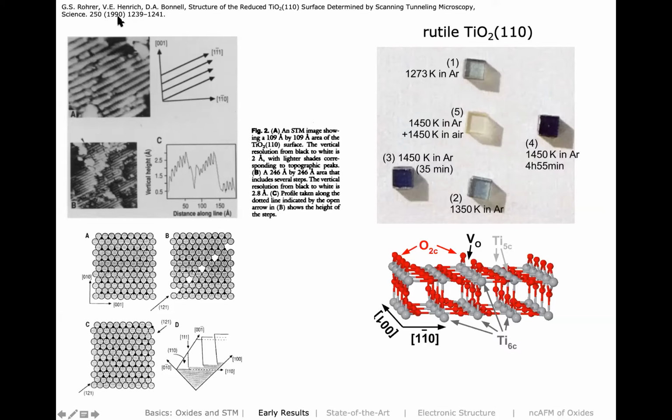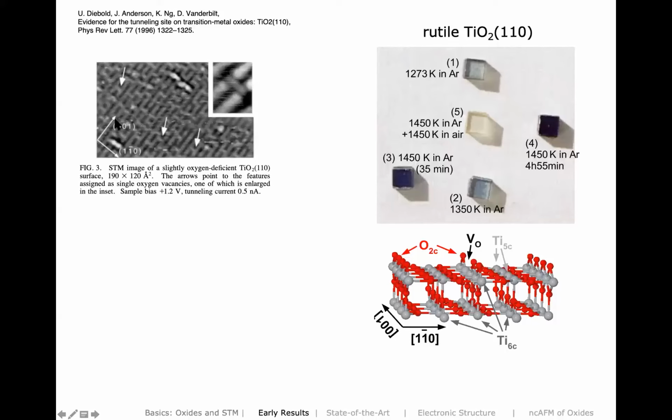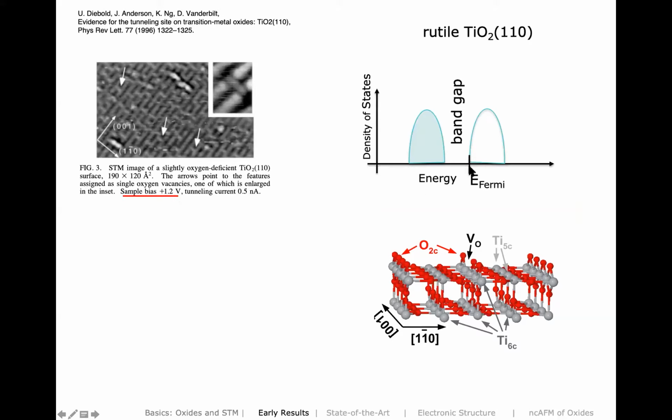So this was 1990. Here comes this young assistant professor from the United States, in 96, and she published her first paper on TiO2, where the directions are right, see 001, and also here these oxygen vacancies. So that's good. I should mention that normally these STM images are taken in constant current mode with a sample bias typically of 1.2 volts. That means, again, density of states, here's the Fermi level, 1.2 volts, meaning we are tunneling from the tip into the empty states. So this is also then clear.